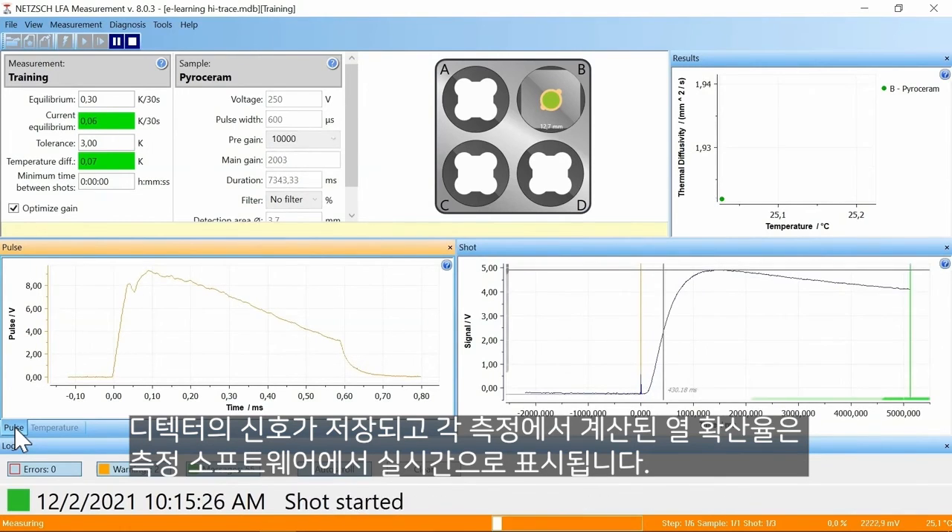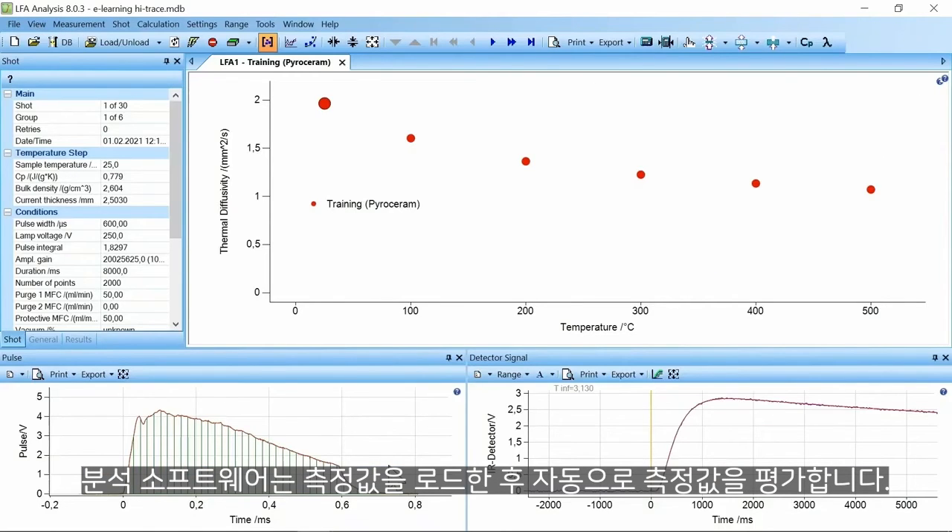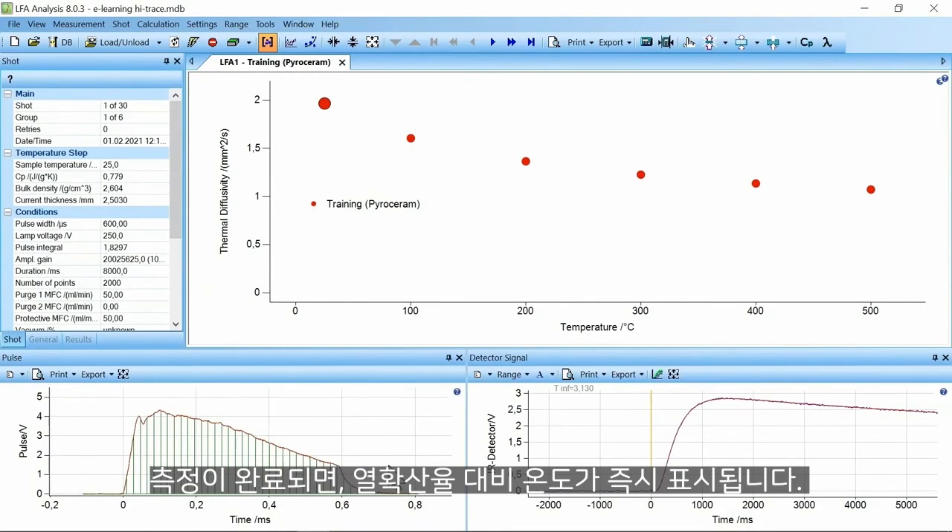The detector signal and calculated thermal diffusivity of each shot is visible in real time in the measurement software. The analysis software evaluates the measurement automatically. After loading the measurement, the thermal diffusivity versus temperature is immediately depicted.